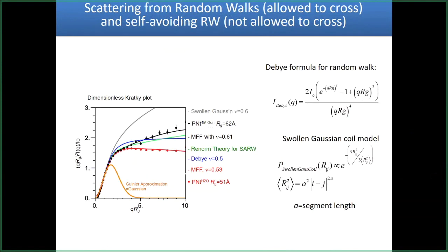So in the ideal case, when you do the dimensionless Kratky, you rescale out the size and shape information, but then there's still the water issue, and that causes a little problem. My general rule of thumb is you can work with all the theoretical models fairly well out to around 0.2 inverse angstrom. So you're saying that you scale at the low Q and take the features at a higher Q? Yeah, so this area is generally good, but appreciate I've already rescaled out the size effect here.